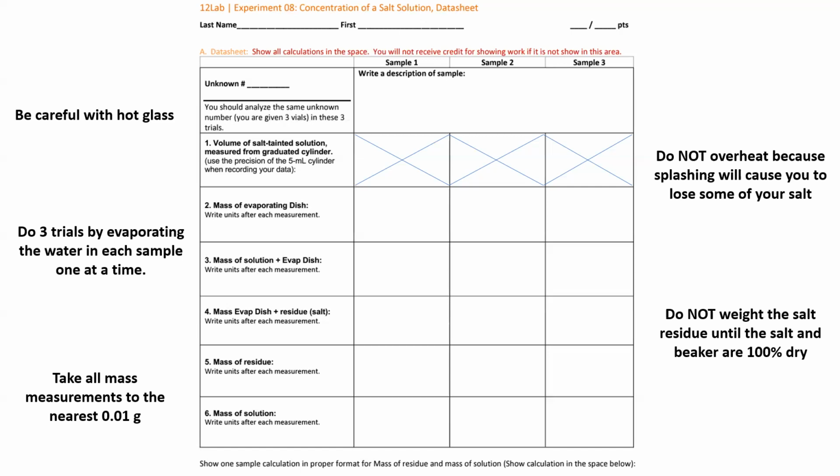So again, if I was subtracting 146.50, so taking that and then subtracting 100.30, I would report 46.20, not 46.2 grams. So that's an important thing to remember, that with subtraction, we need to look at the number of places past the decimal and make sure that we're consistent with always recording to that place.